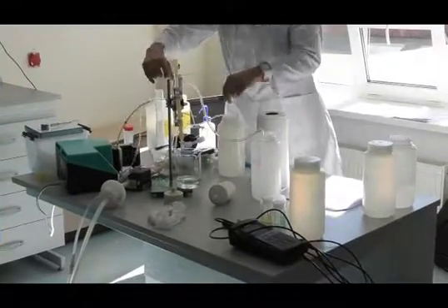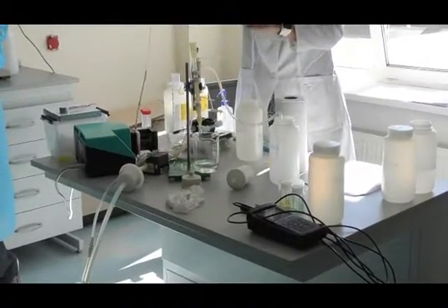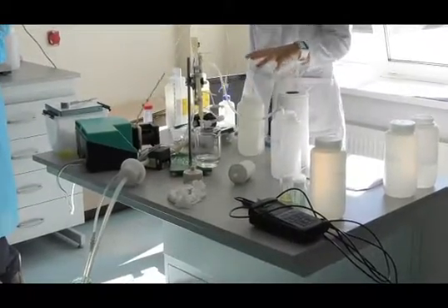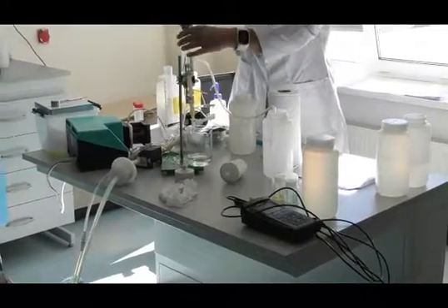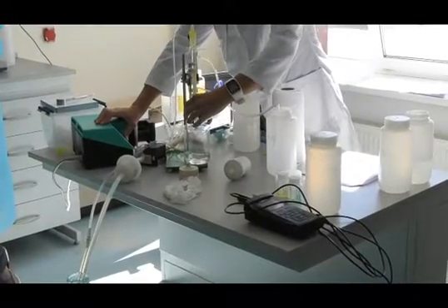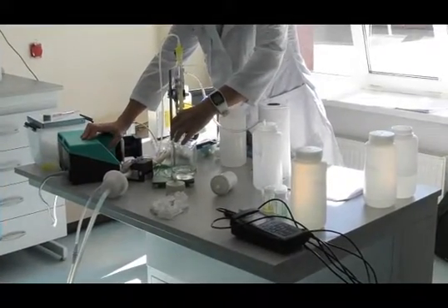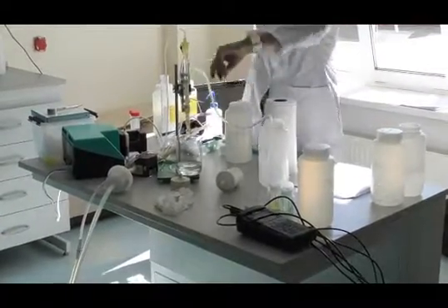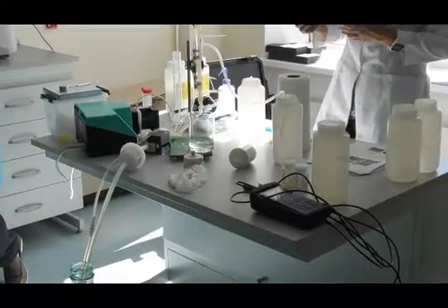and as soon as I've made enough sample of that one, I will start with an exchange to make sure it's not too long from the sampling of the ultrafiltrated fraction until I put it on the column. I need much lower speed. And then I just take it through the column, and this is an anion exchanger.